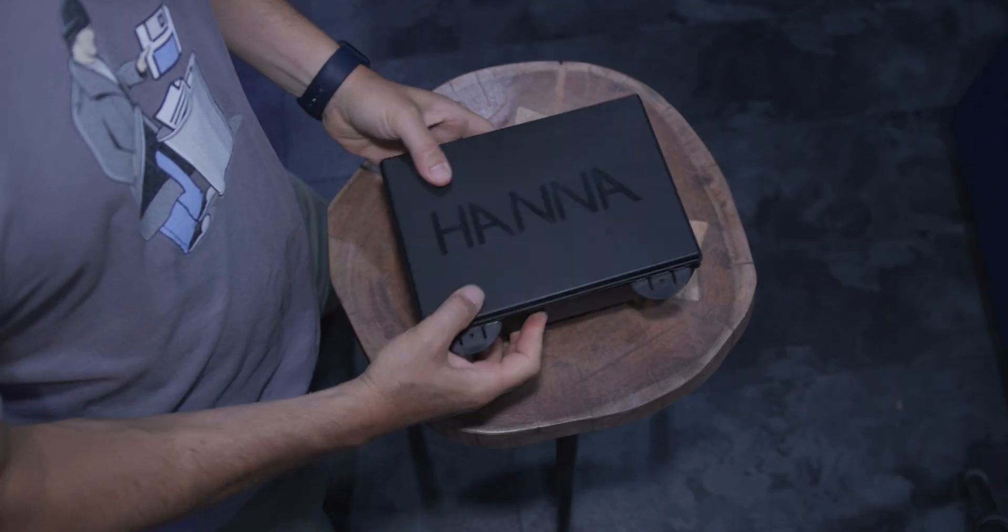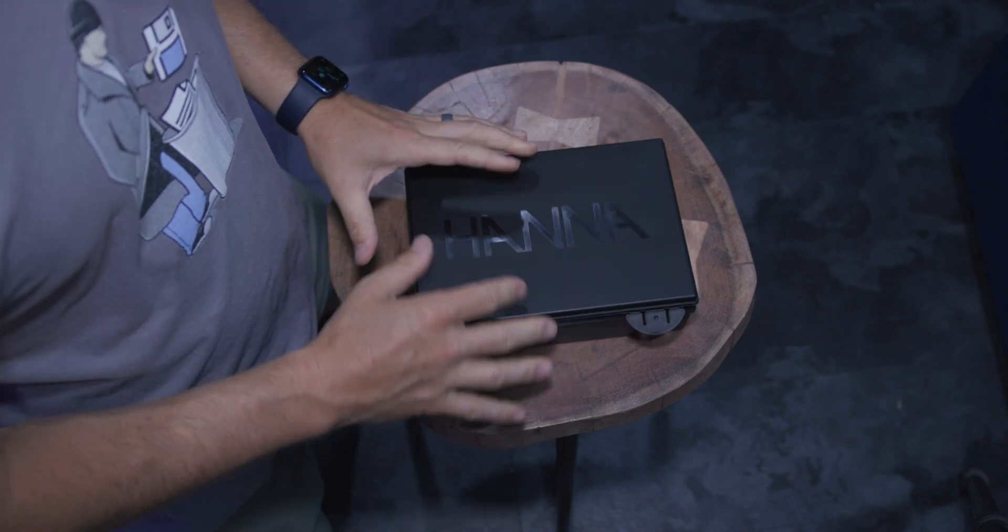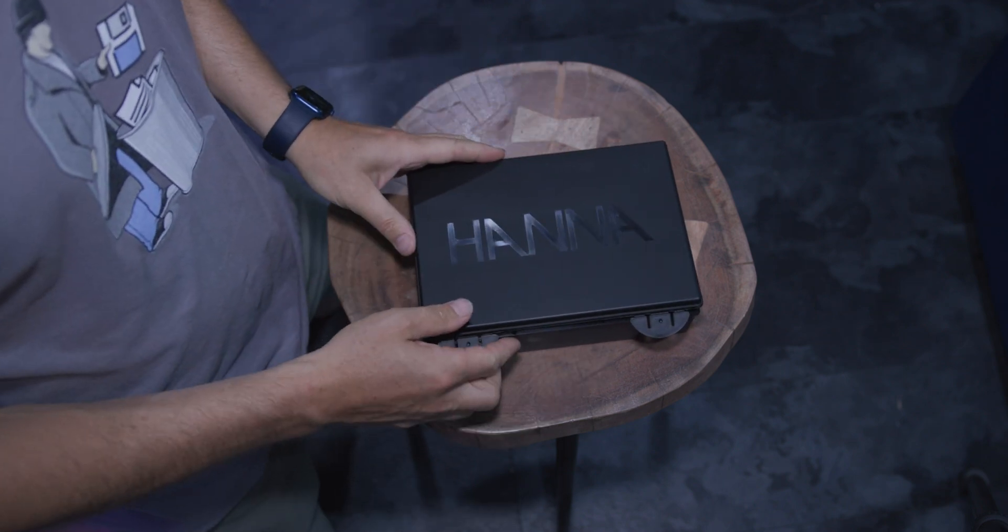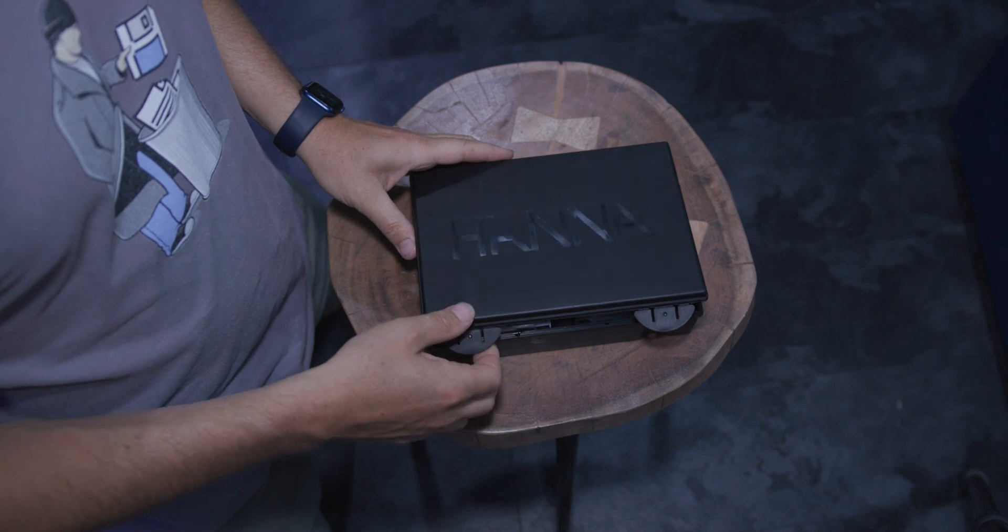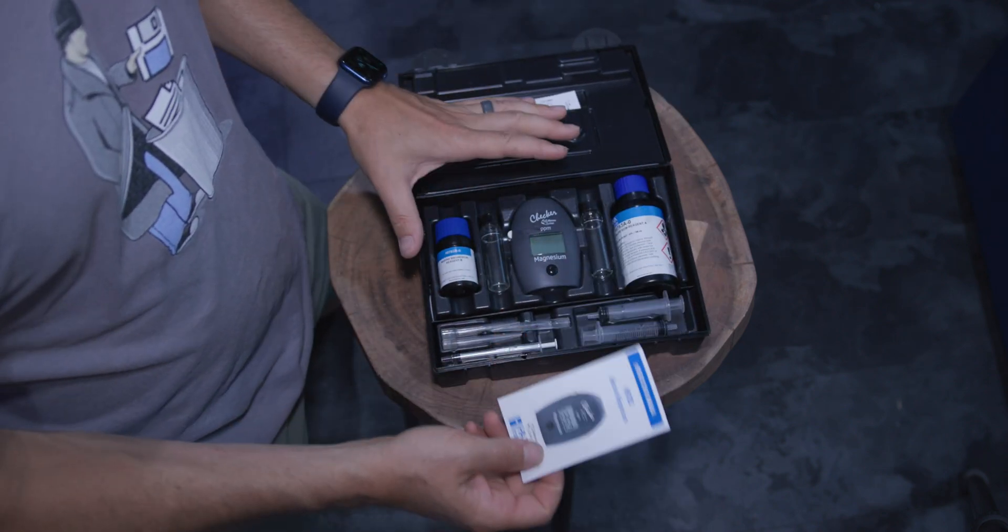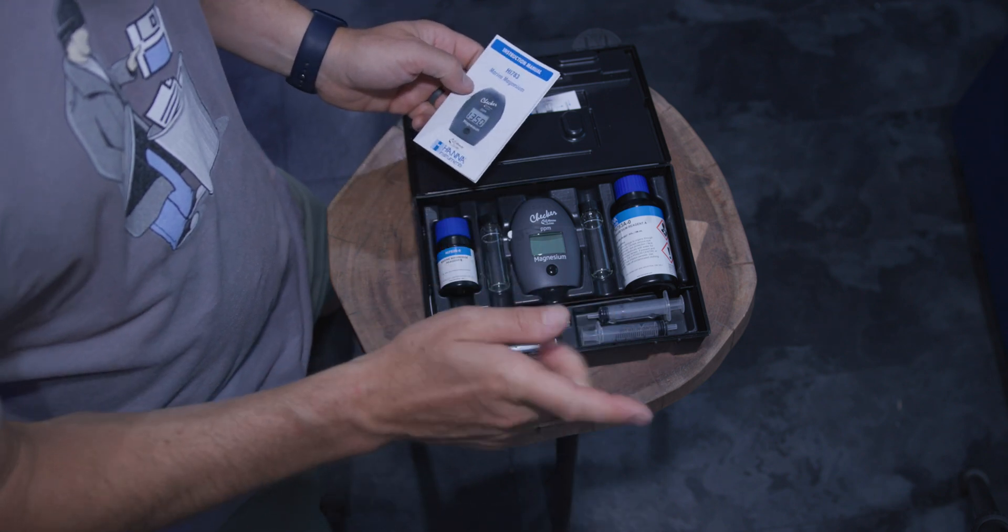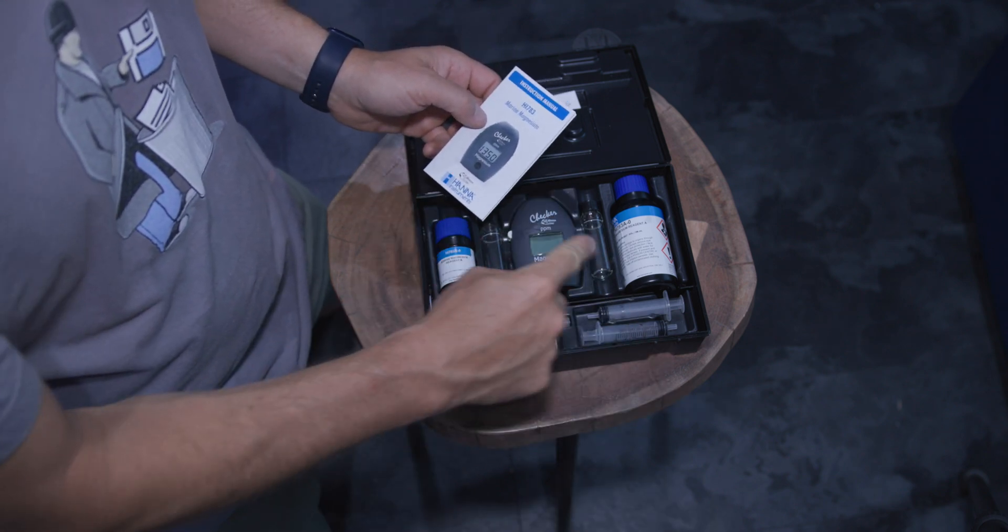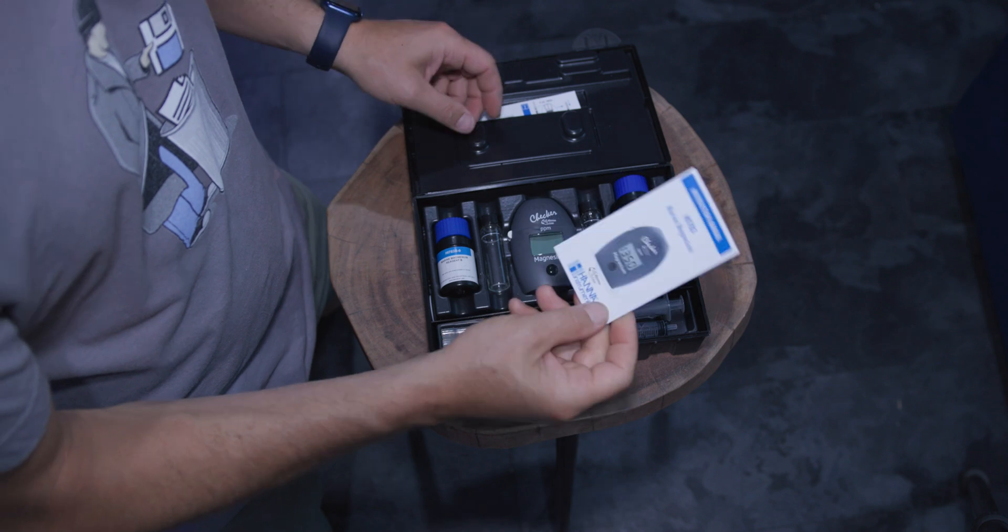All right, here we go. First thought, this is a bigger box than the alkalinity or the phosphate reagents or kits. I expect there's more to it. This is a tester unit sent to us. The boss used it. He sent it to me. If you're seeing some liquid in here, he's already used it. We have written instructions.